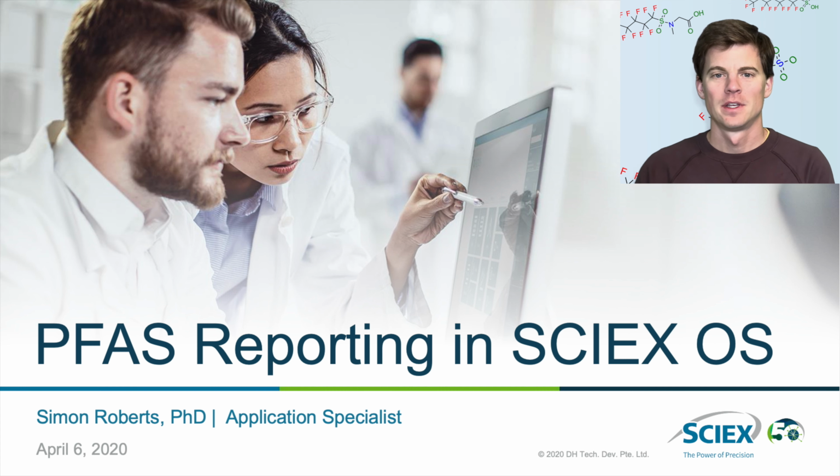Hello and welcome. So today I want to talk about data reporting, specifically in SCIEX OS. This will be related to PFAS, but could be used in any type of method.